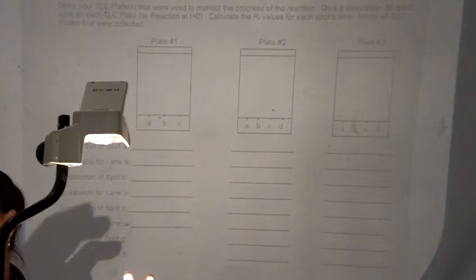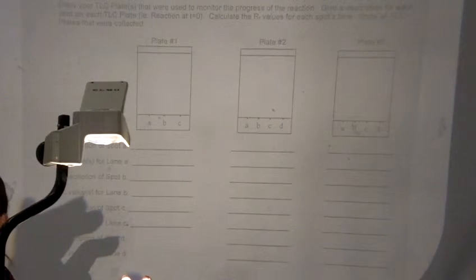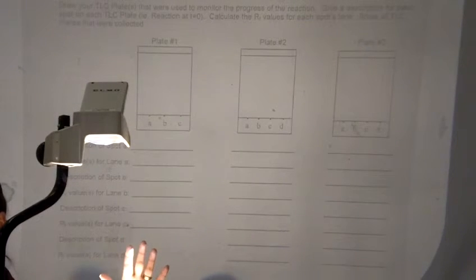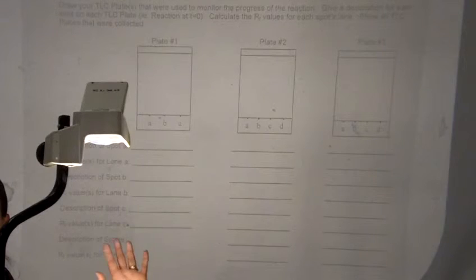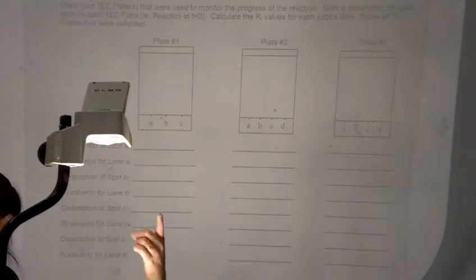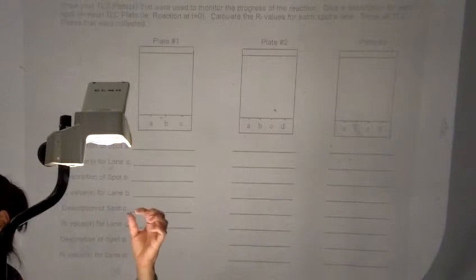Another thing with Rf values, they're not like melting points or boiling points. Rf values do not decrease because of impurities, all right? So if you see a lane on a TLC plate with 1 spot, that means it is pure, okay?